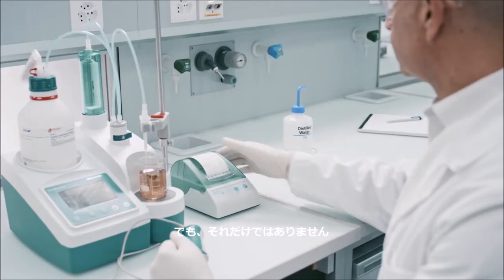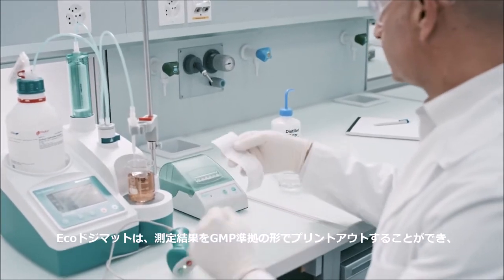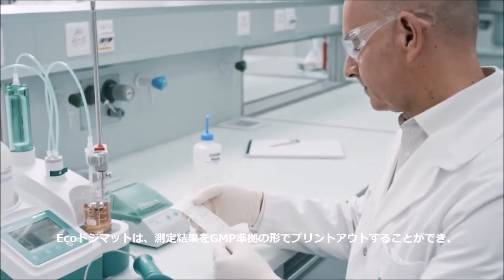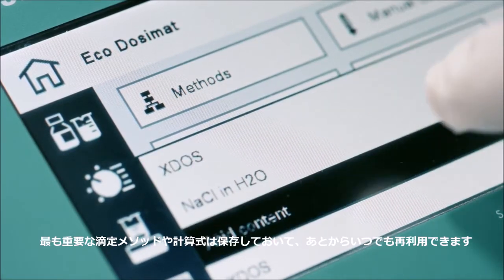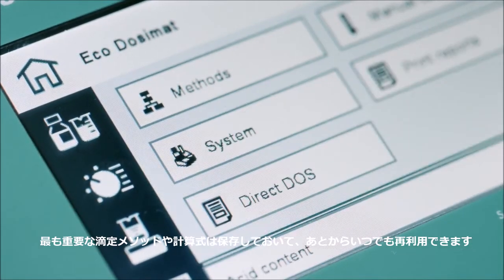But that's not all. With the EcoDosomat you can print out GMP compliant results, and your most important titration methods and calculations are saved for reuse whenever you need.